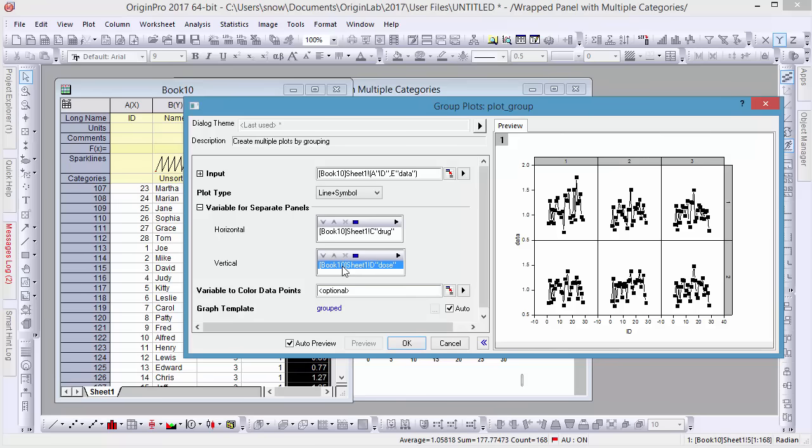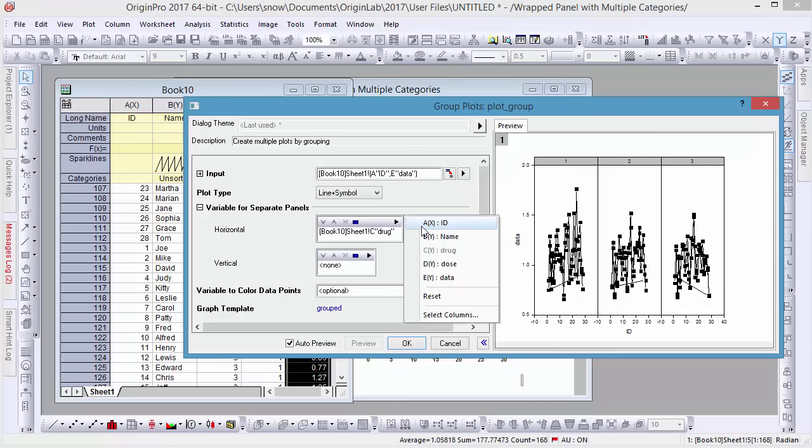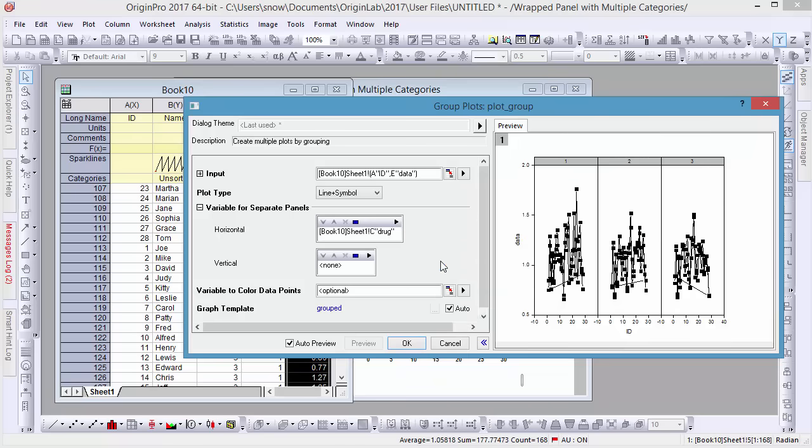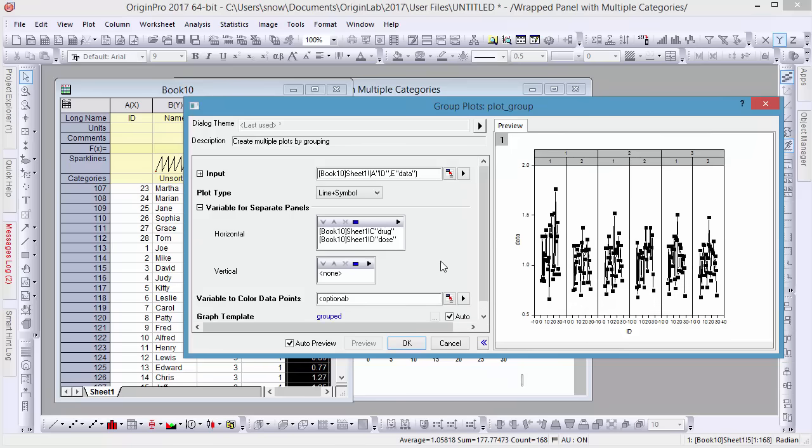Let's take this a step further. This dialog supports multiple variables for a single panel direction. To demonstrate this grouping capability, instead we'll set both drug and dose as horizontal variables, returning a single row, further differentiated by groups of data within groups.